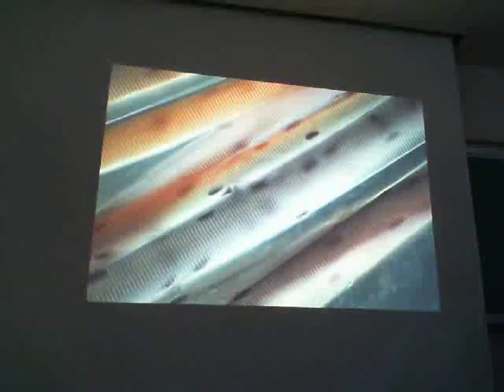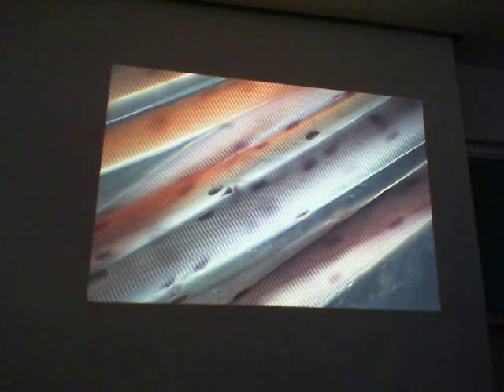How about this tissue right here? Smooth muscle. Okay, very good. And this tissue? Skeletal muscle. Okay, now this is a little bit unfair since this is taken with Nomarski interference microscopy. What is that dark band that you see right there? A band. And the light? I band.